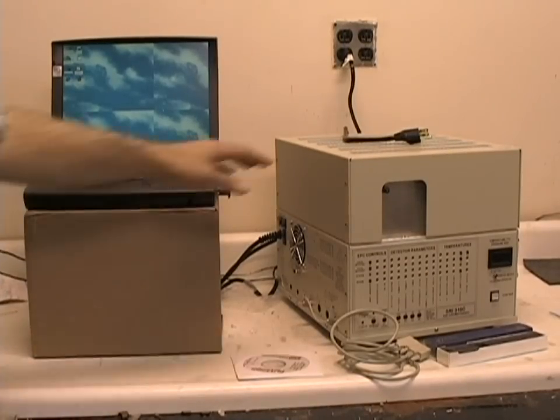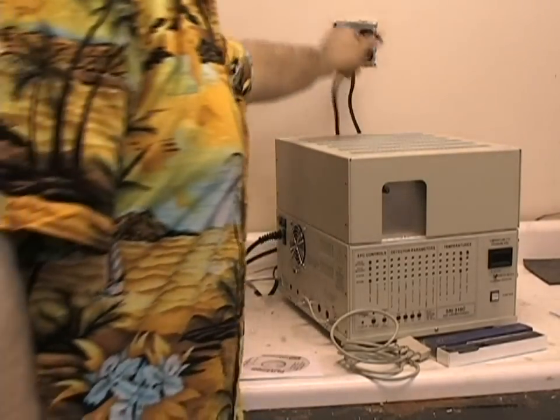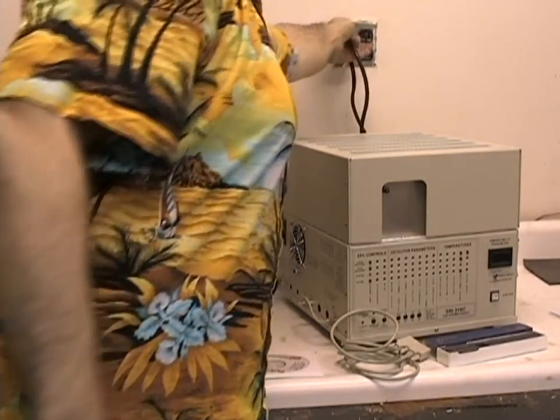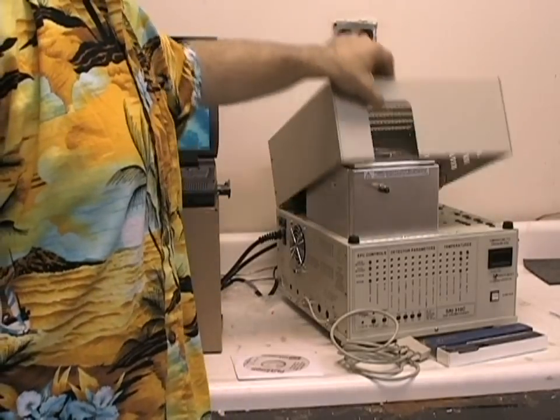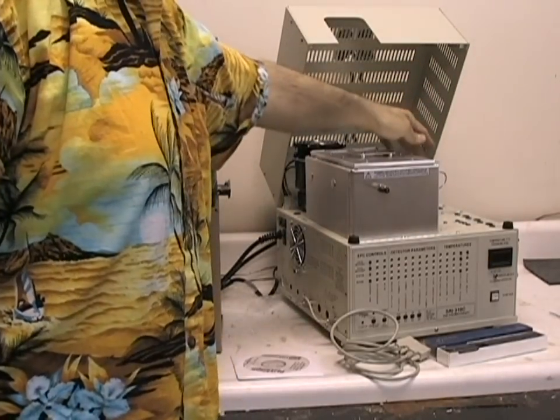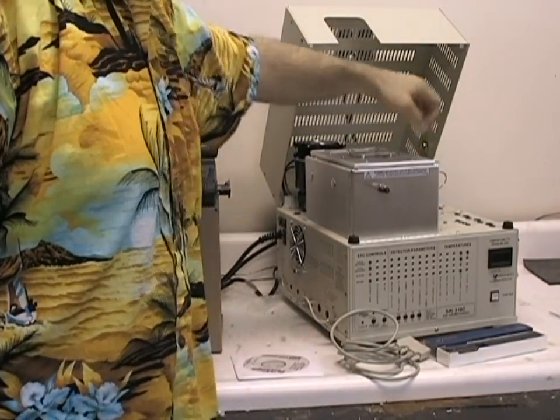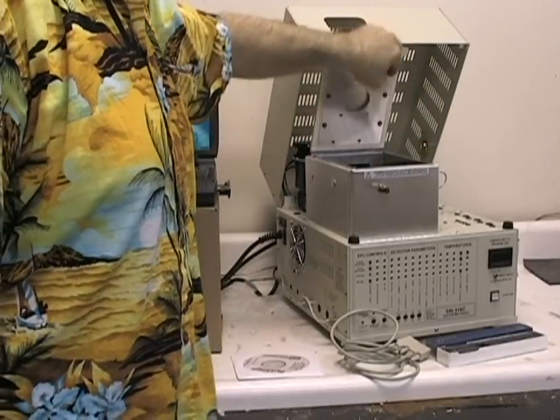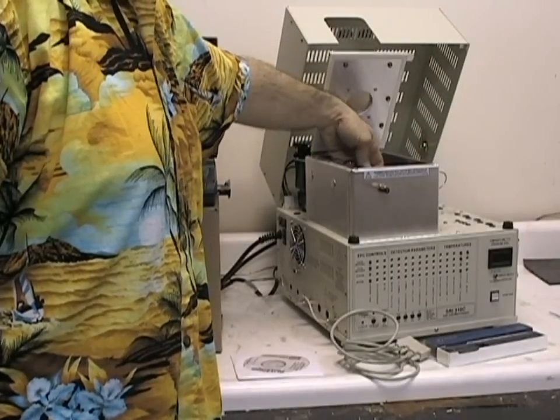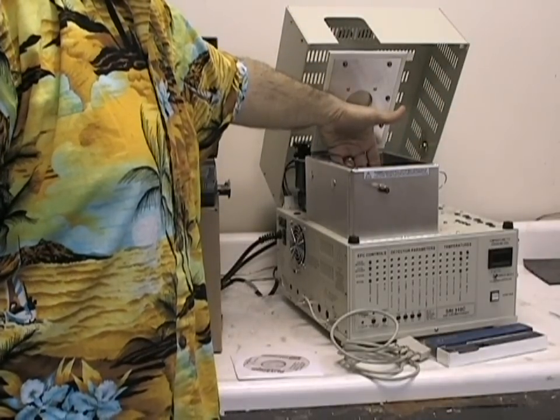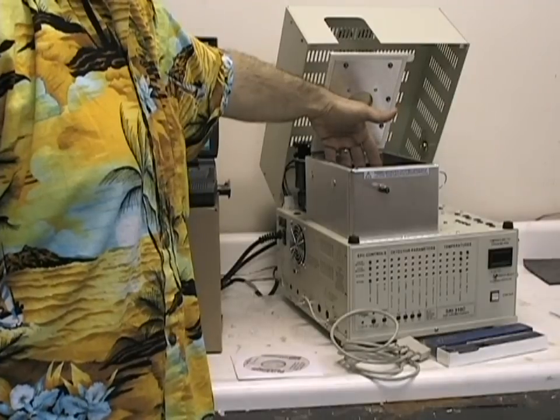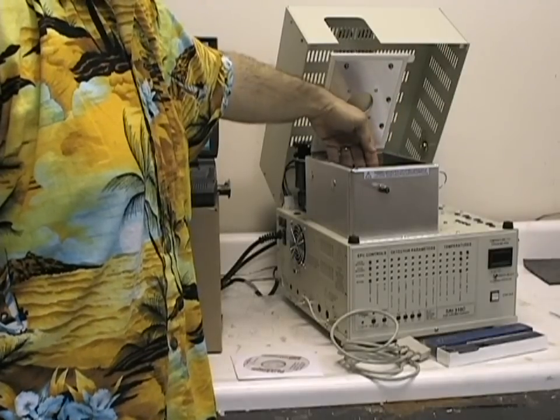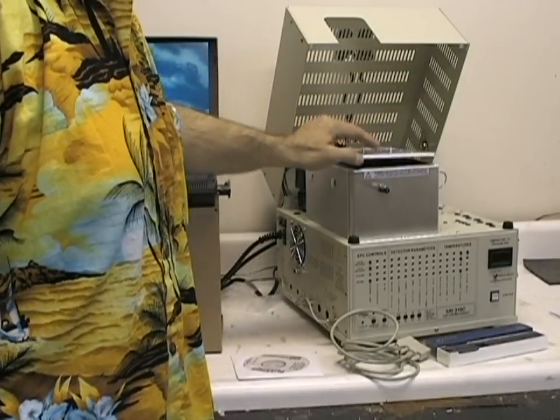The 310 Air GC runs normally off a 110 volt, 10 amp circuit. It comes equipped with a catalytic combustion detector and a 3 foot HACEP porous polymer column. This can be changed out for other pack columns or even short capillary columns for specific experiments.